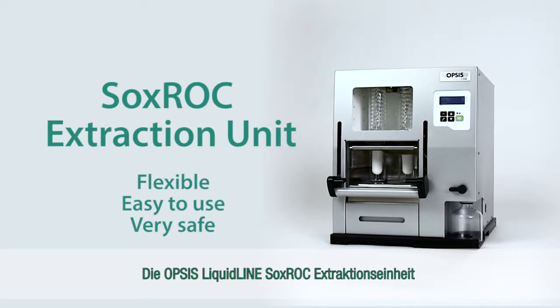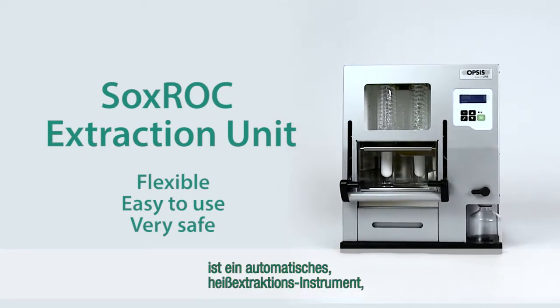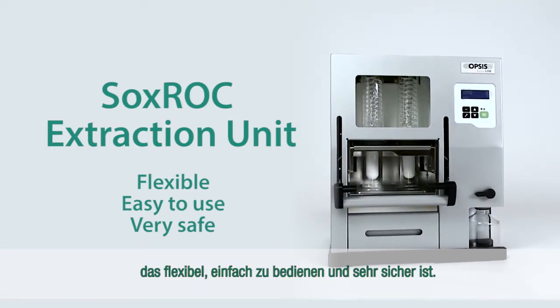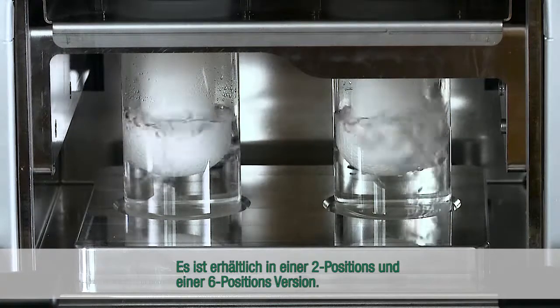The Opsys LiquidLine Soxrock Extraction Unit is an automated hot solvent extraction instrument that is flexible, easy to use and very safe. It is available in a 2-position and a 6-position version.